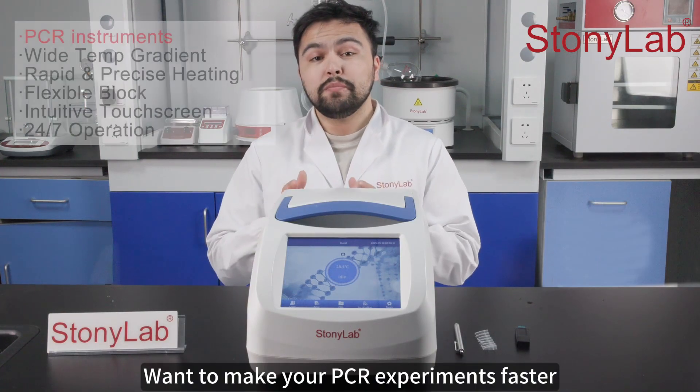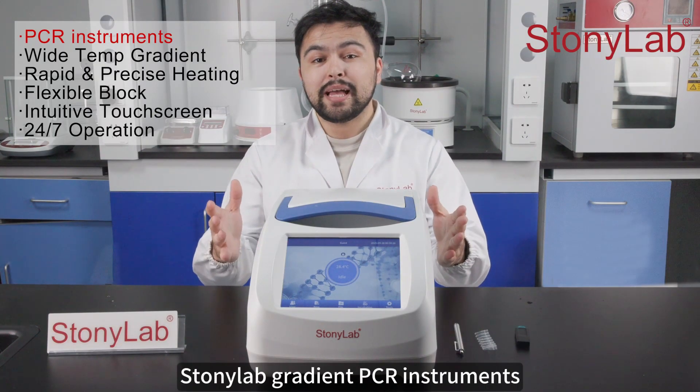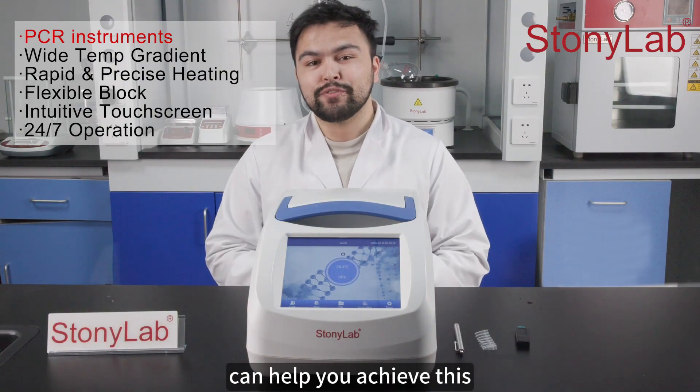This is StonyLab. Want to make your PCR experiments faster and more efficient? StonyLab's Gradient PCR instruments can help you achieve this.